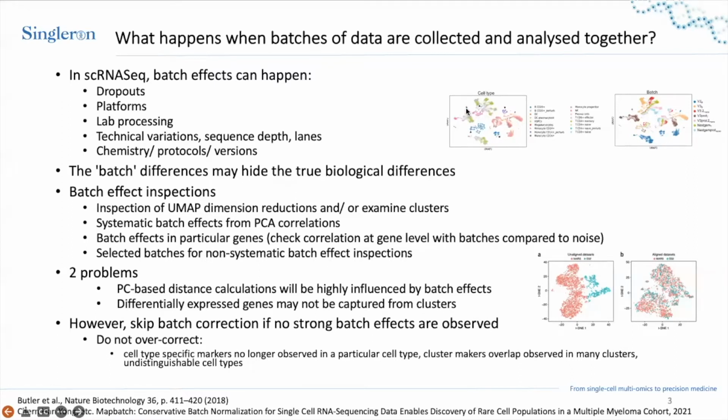So we are expecting from the left side, for example, that all of the close colors should be located at approximately similar locations, so that later when the clustering is calculated from PCA, for example, it can return meaningful results, with clusters mostly driven by the cell types.